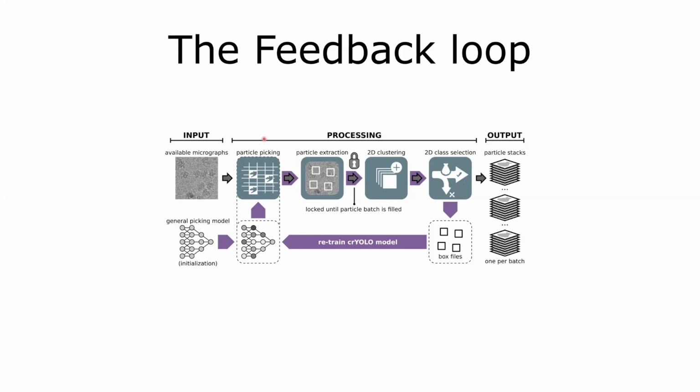This is basically working because our 2D clustering with GPU ISAC is fast and reliable. The idea is that you don't say I want 200 classes, but I want like 100 images per class, and therefore one class cannot get so big that it sucks up basically all the particles from other classes, but it evenly distributes the classes, and therefore the classes themselves are quite pure.